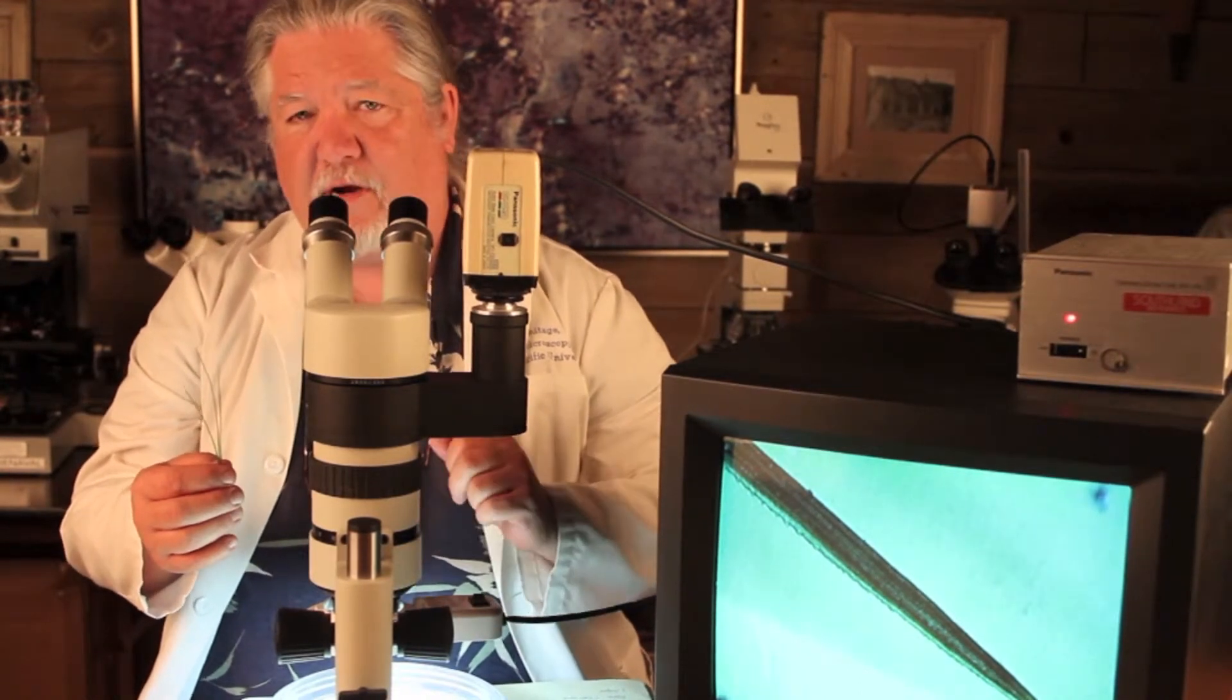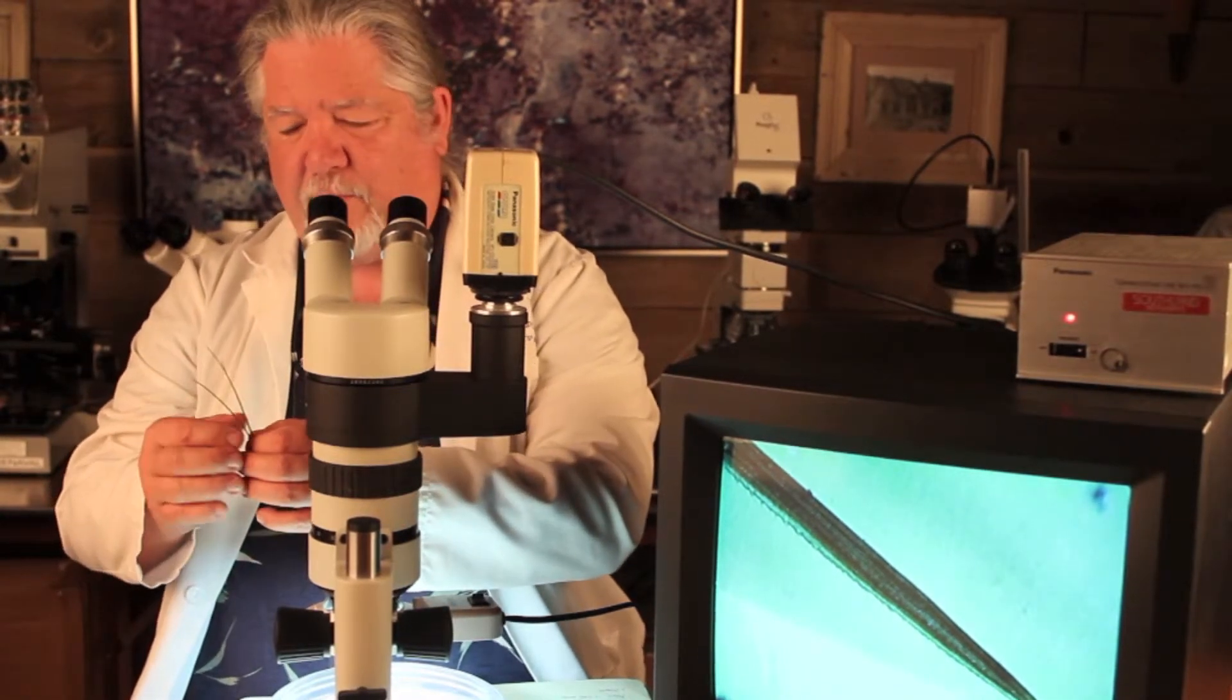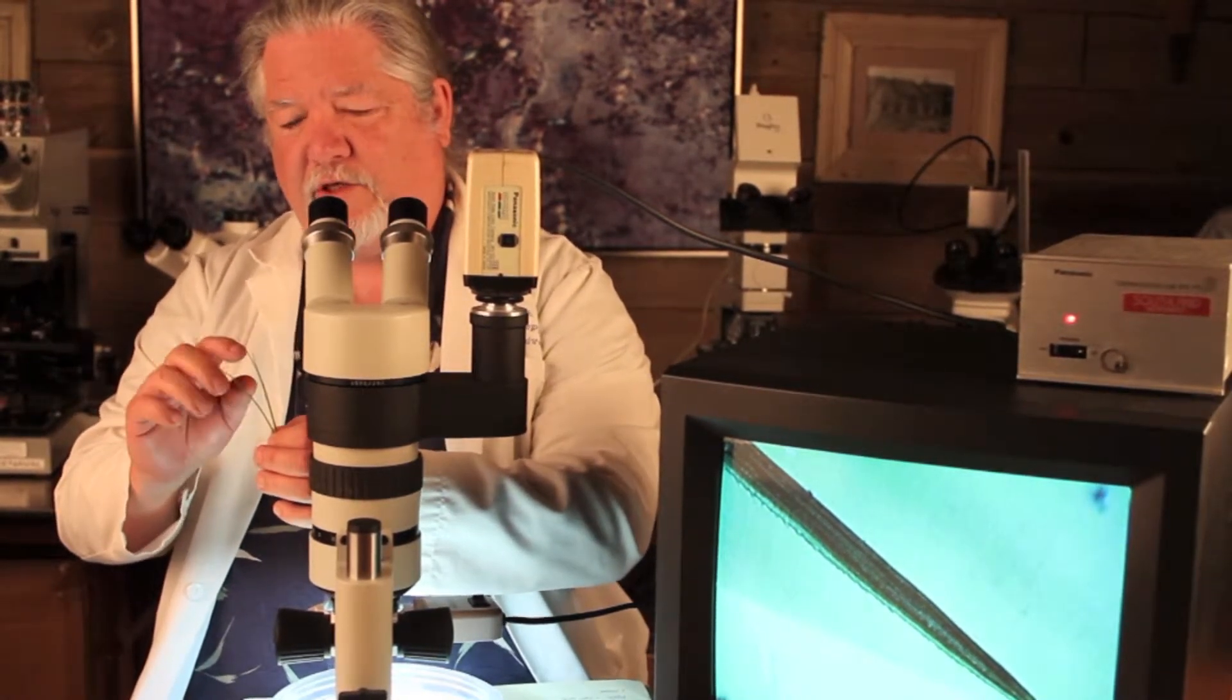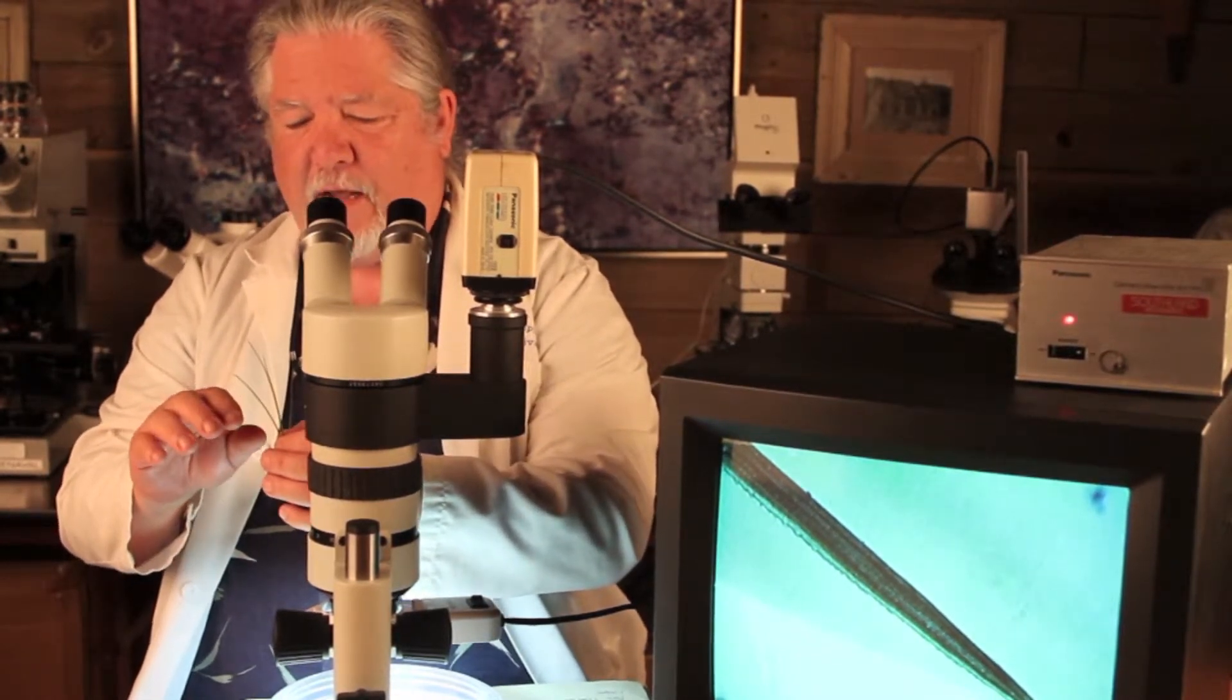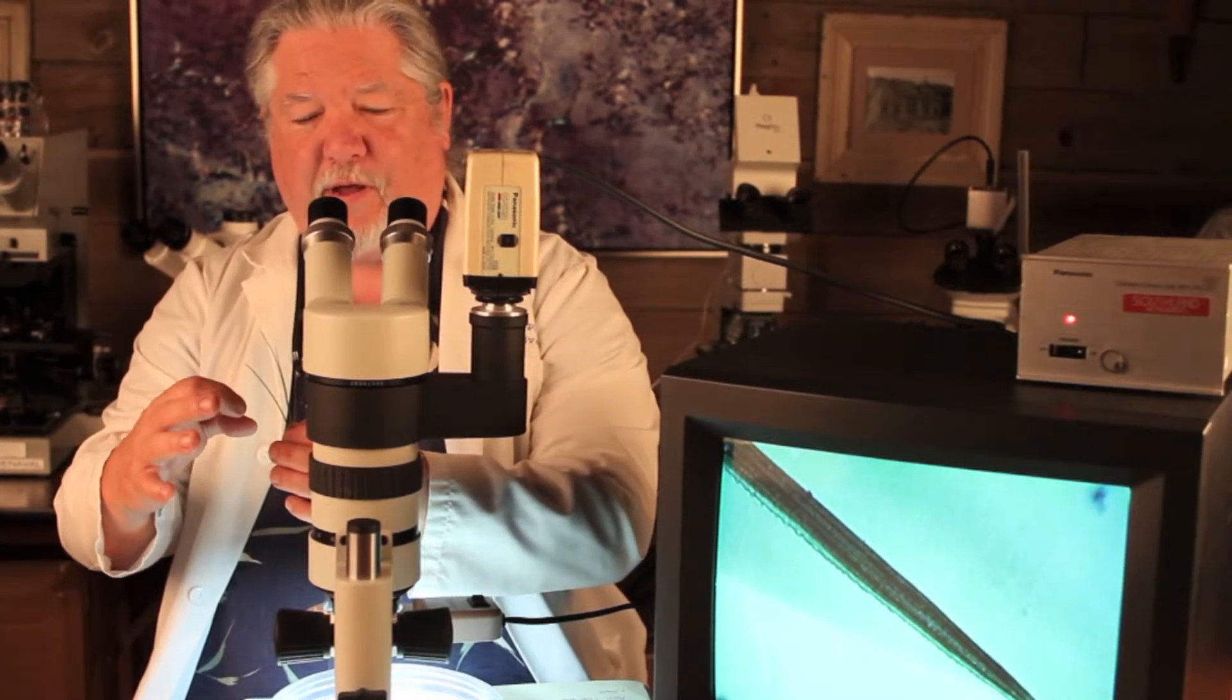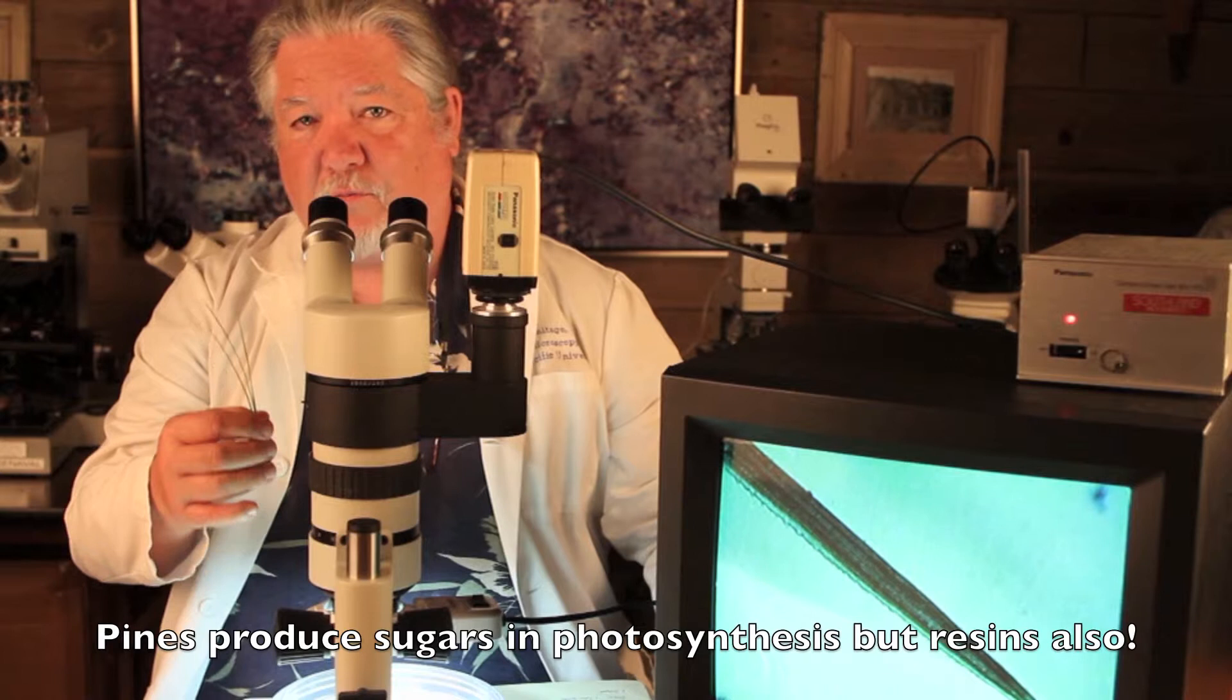And so we're going to try to cut some here while you're watching and make some thin sections. But a couple of other things that I want to mention about these pine needle leaves is that when you thin section them or cross section them, you see different shapes. They can be circular in cross section, they can be oval, they can be triangular, very nicely equilaterally triangular, or you can have a squished triangle where one side is indented. And then you can have cross sections that look like pizza slices. But one thing that's very interesting about them is that they do photosynthesis and they don't produce the usual product that other leaves produce when they're doing photosynthesis.